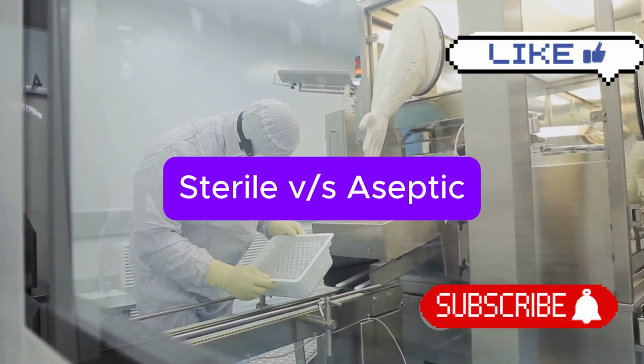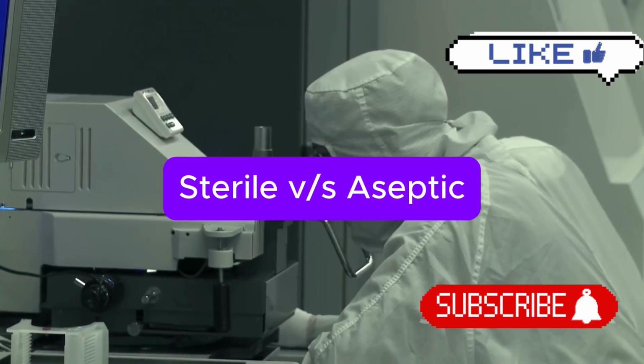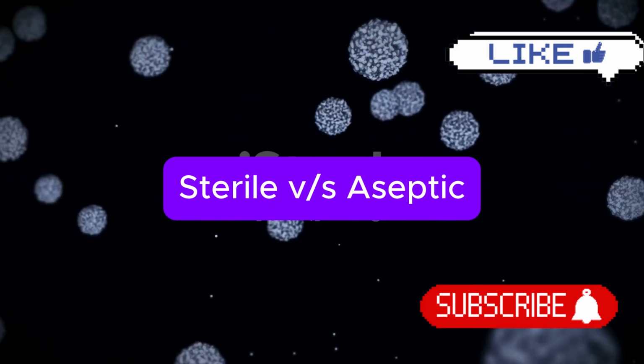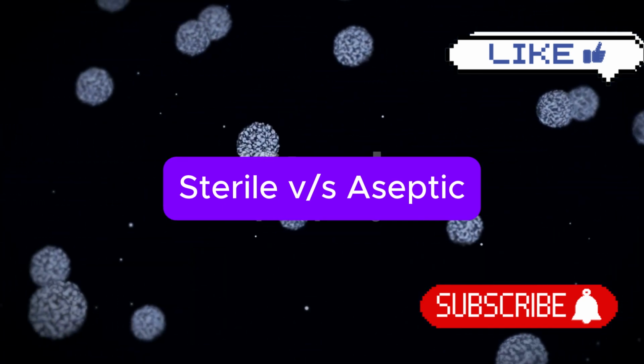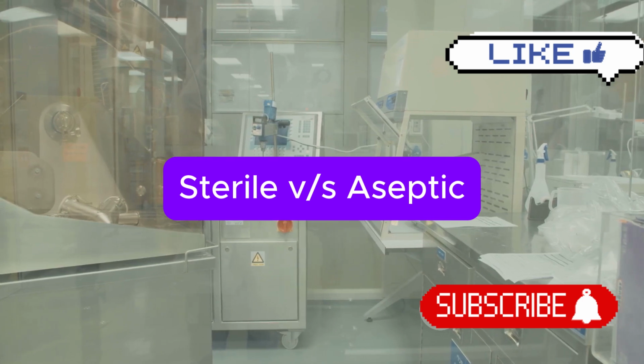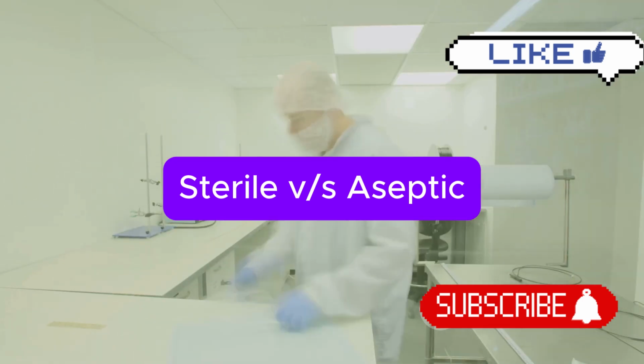Let's start with sterile. In simple terms, sterile means completely free from all living things. This includes bacteria, viruses, fungi, and even spores, which are like tiny dormant seeds of microbes. Think of a sterile object like a blank slate with no living organism able to grow on it. Achieving sterility is a big task.